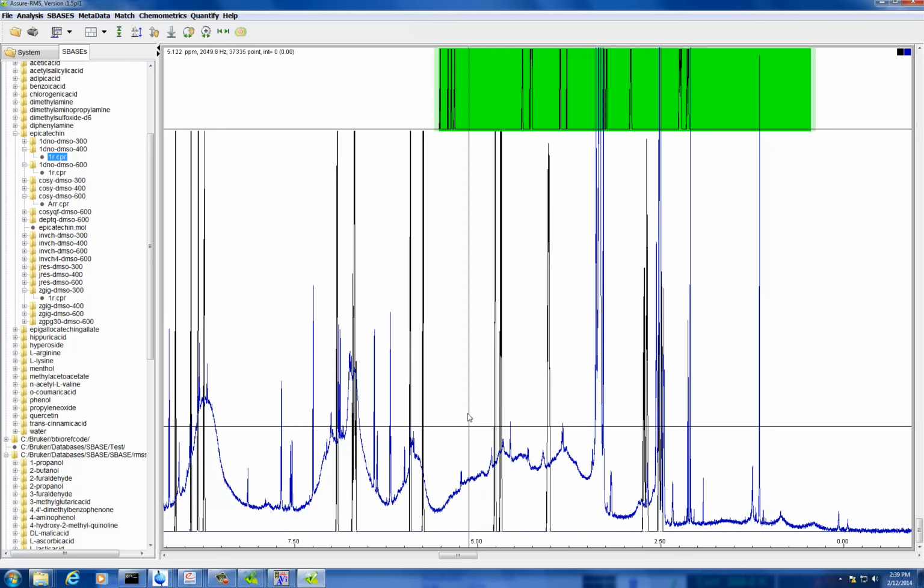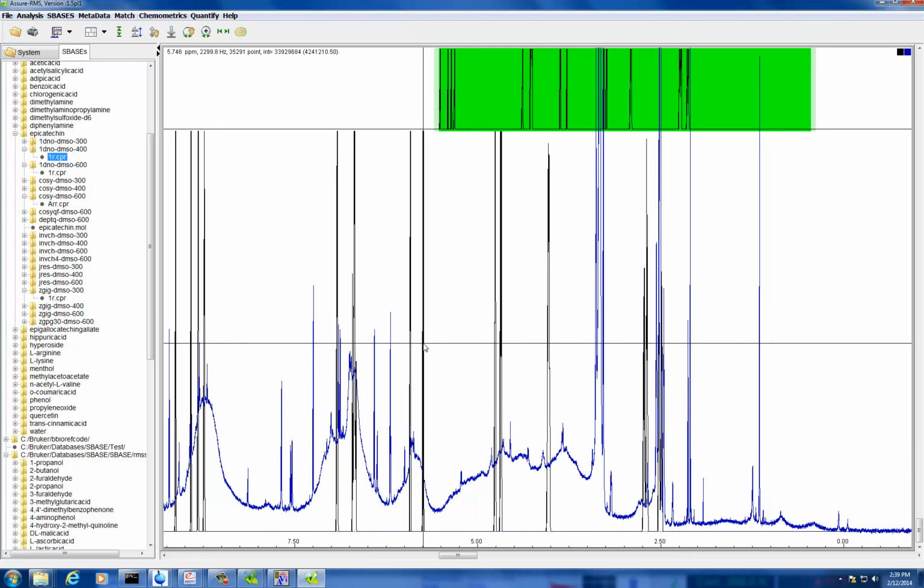Okay. What is CPMG? Those are the four NMR gurus that wrote that pulse program. They wrote it separately, and then they were going to publish at the same time, and they were like, oh, let's just join it together, and then they made it CPMG. So that is a filtering technique that focuses on small metabolites.